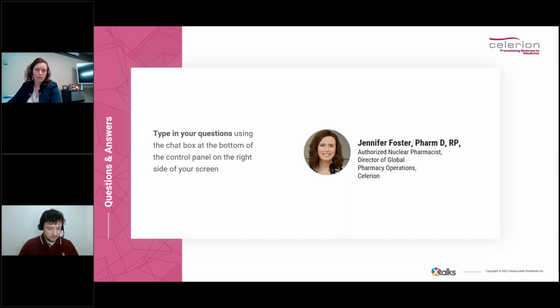So the staff is recertified every 6 months also. We do glove fingertip testing as well as media fill testing. So the designated person oversees that. And if there's any kind of failure in that, then it's the same kind of system. We will do retraining and then we will test them again. And they would not be allowed to compound during that time if there was a failure.